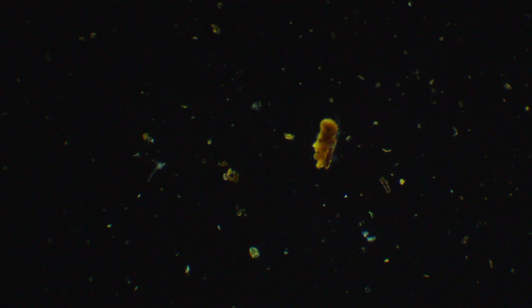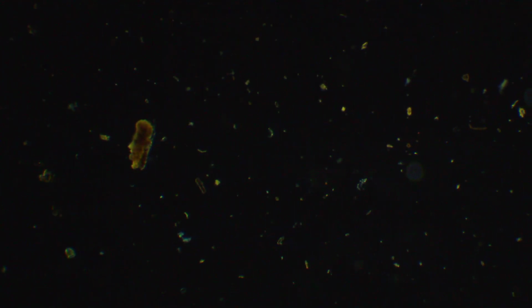So I think this sample has the highest number of paramecium looking things that I have seen so far. So that's kind of interesting. And I did see that big bug, which looked big anyway. I could still not see it with the naked eye. So, big is relative. Objects on your screen may be larger than they appear in real life, as in, you may not be able to see them at all.